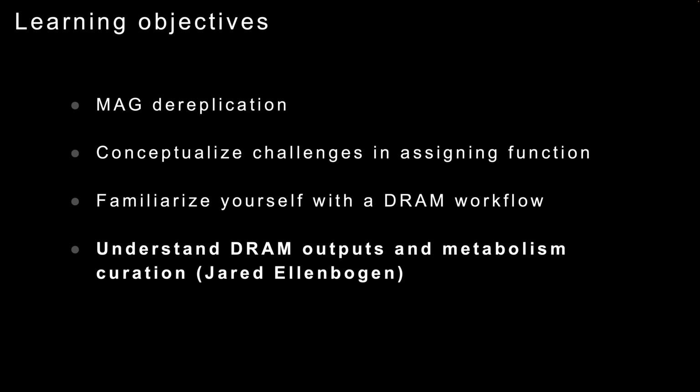Can we also get gene expression level through DRAM? Not currently, but it's in DRAM 2, which we're really excited about. But yes, DRAM does output different files, GFFs and things that you can go ahead and input into something like an expression mapper. But it doesn't do it on its own. It is coming though. Other questions?